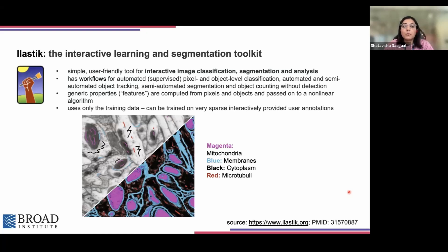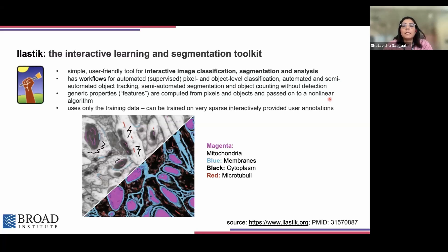Ilastik is a very simple, user-friendly, and openly available tool. It can be used for interactive image classification, segmentation, and analysis. There are many automated workflows already available within Ilastik, and it can be very easily trained for many different kinds of images. It can also be used for tracking purposes. Lines are drawn to demarcate specific areas in an image, and then it can be trained to make predictions, as shown in the panel on the right.